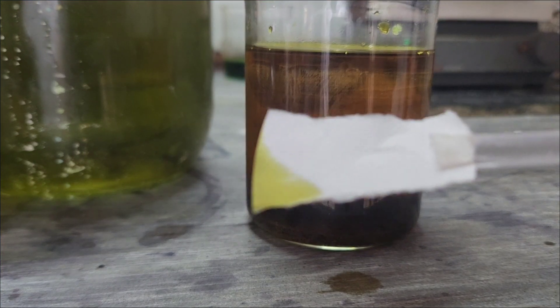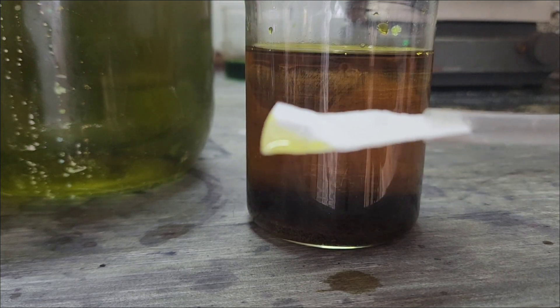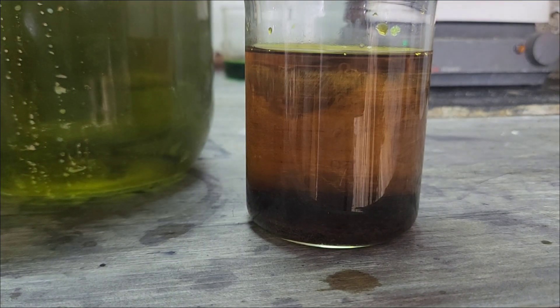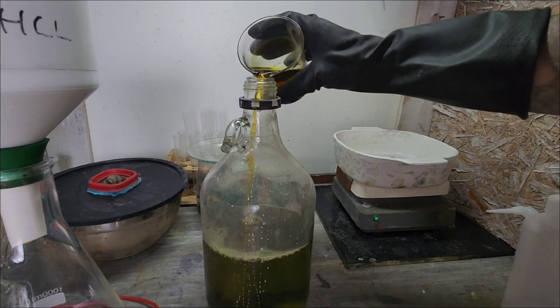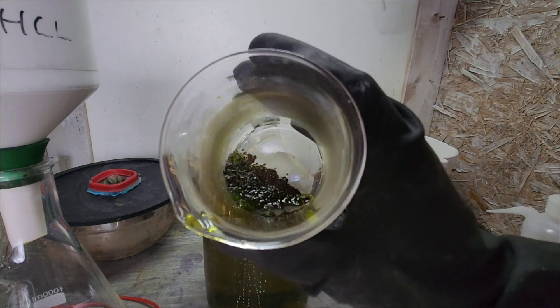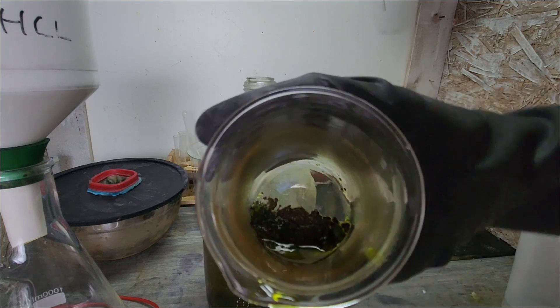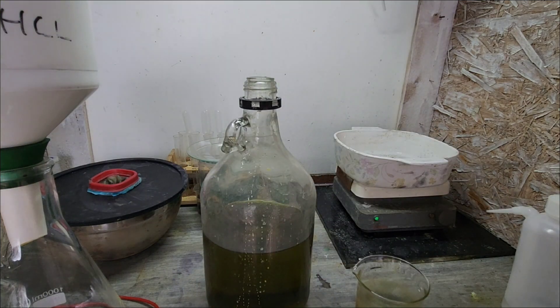Time for some stannous chloride. Perfect, I'd say we got it all. Check what this gold looks like. We still got some crystals in there — we'll have to get those out; a little hydrochloric will take that out no problem. Does look nice and fluffy. Alright, well that's awesome, it works!